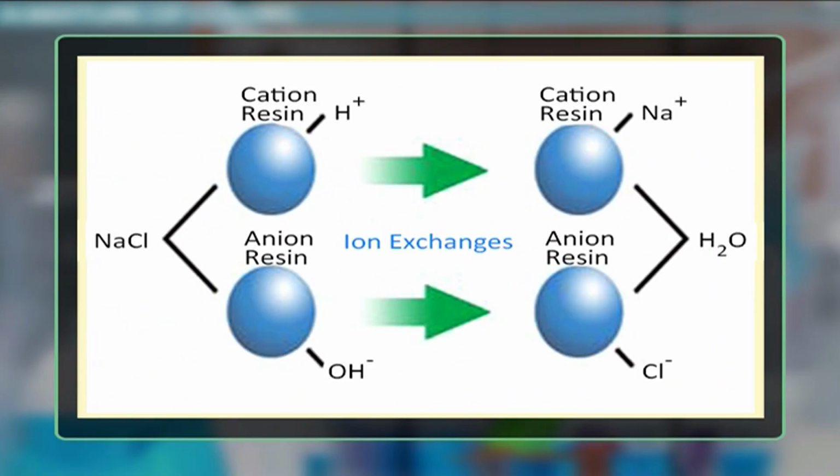Sodium chloride is probably the most widely used and mild eluent for protein separation because it has no important effect on protein structure. However, NaCl is not always the best eluent for protein separation. Retention times and peak widths of eluted proteins, and so chromatographic resolution, are affected by the nature of the anions and cations used. These effects can be observed more clearly with anion exchangers as compared to cation exchangers.